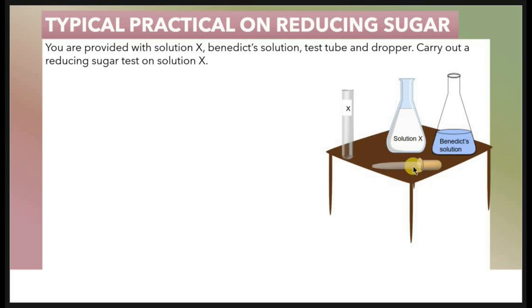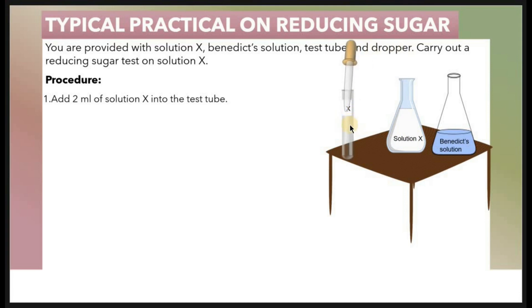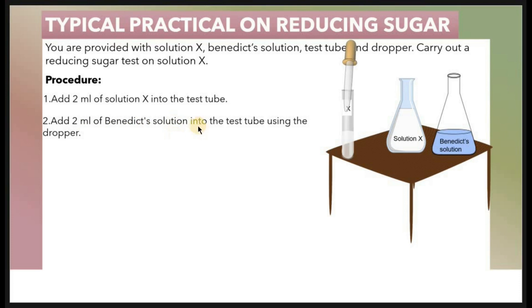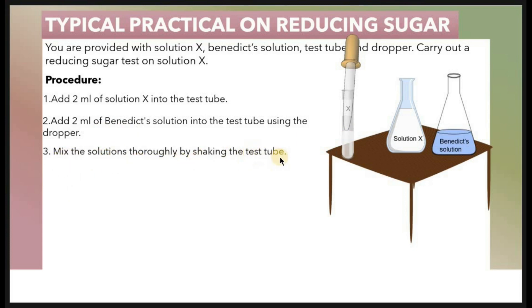The procedure is as follows: add 2 mL of solution X into the test tube using the dropper. Then add 2 mL of Benedict's solution to the test tube using the dropper. Mix the solutions thoroughly by shaking the test tube so that they mix well.